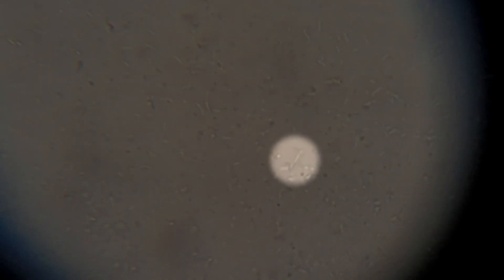If you look closely, you will see how this bacteria is moving. And this one is going much faster.